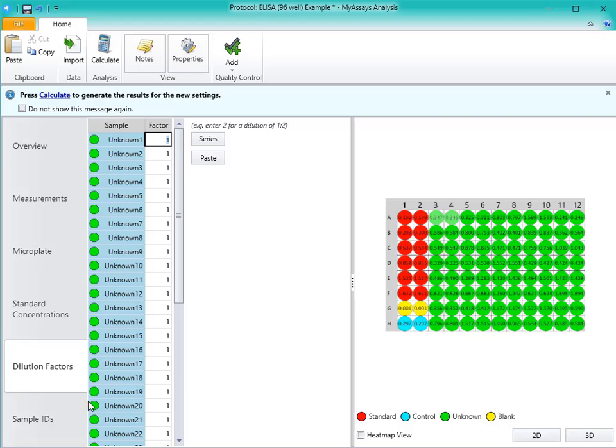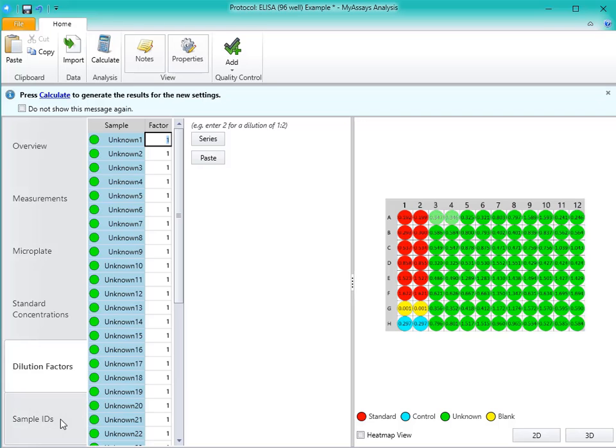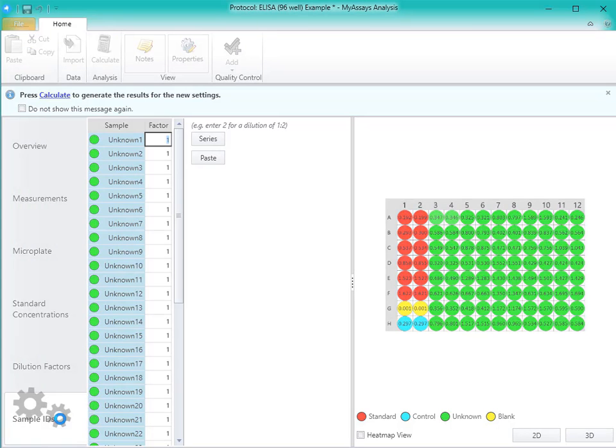On the Sample IDs tab, you can enter individual sample IDs, or you can copy and paste them in from another application.